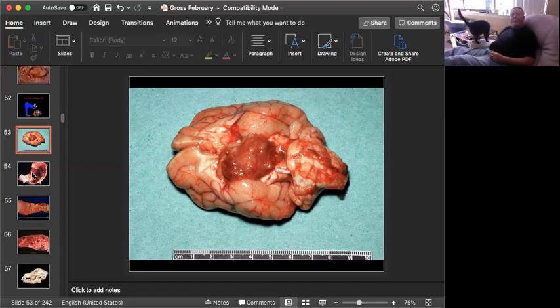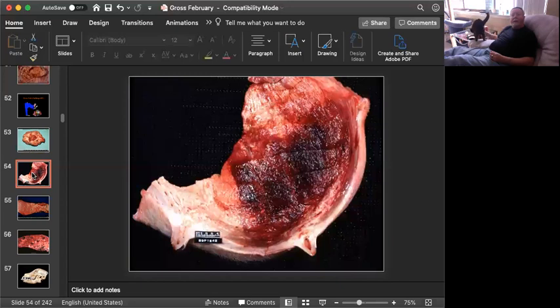Slide number 2 is tissue from an ox. Can you give me a morphologic diagnosis and 3 possible causes?